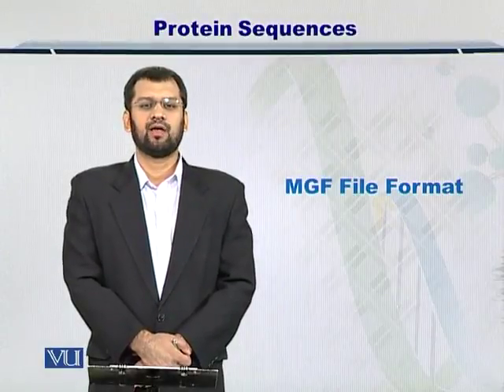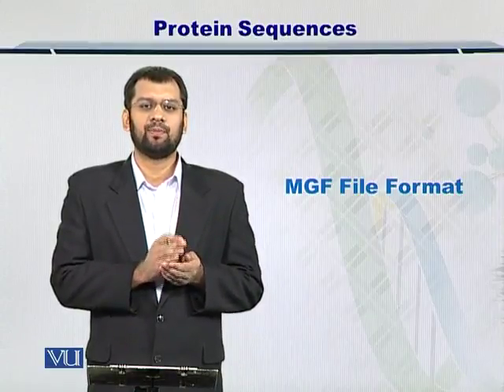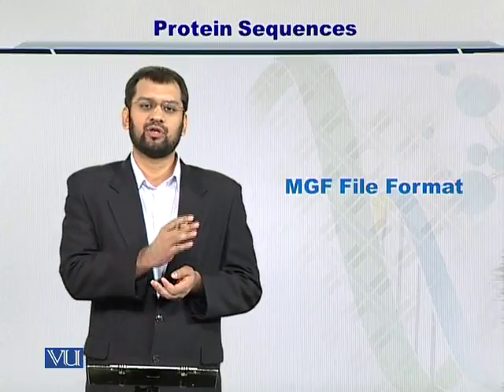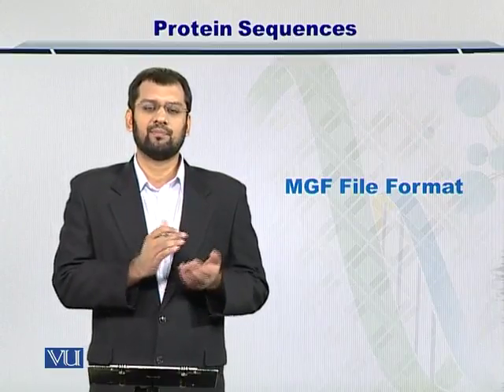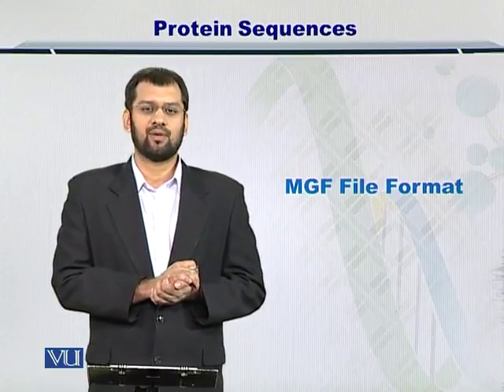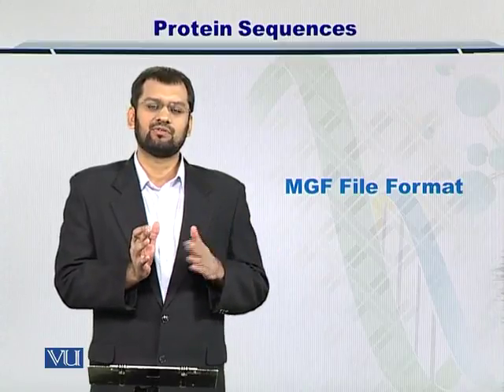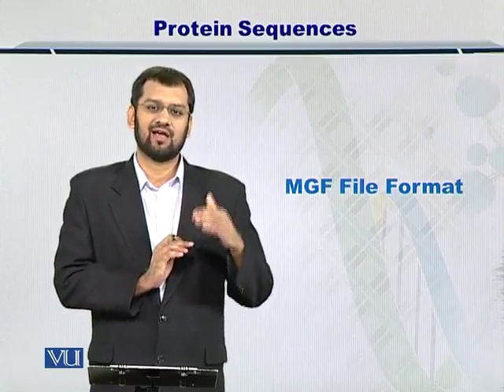Dear students, as proteomics evolved, people started realizing the need for open data formats. Now, every instrument, every mass spectrometer that was there in the research labs was outputting data in its own unique raw file format. So, Matrix Science, a company, came up with the MGF format, or the Mascot Generic Format. As is obvious from its name, it's a generic format, so it can incorporate data from multiple mass spectrometers, which may output files in different raw formats and represent them in a standardized way.